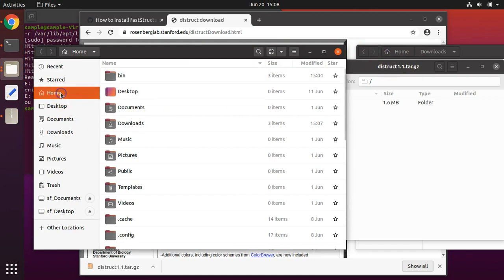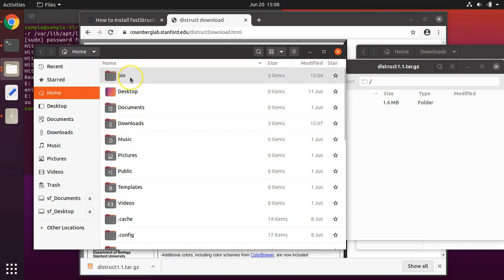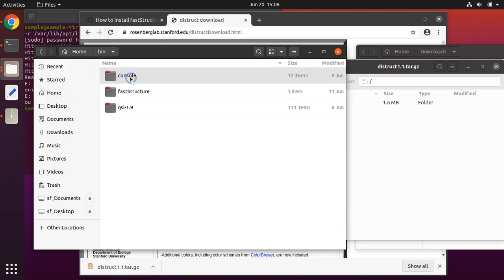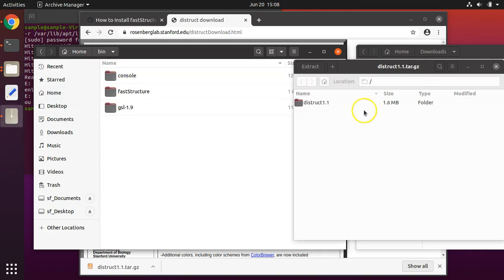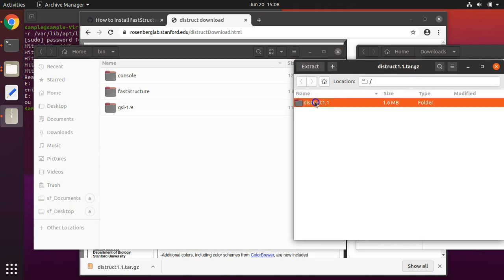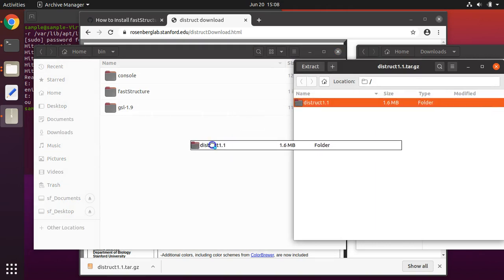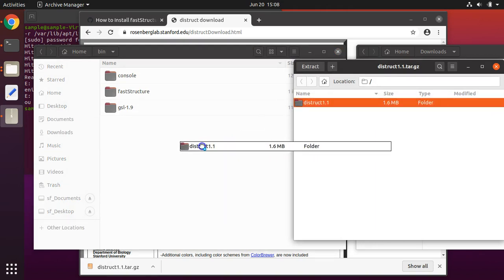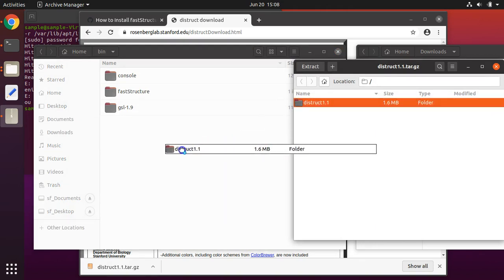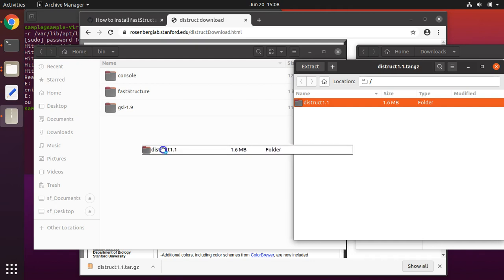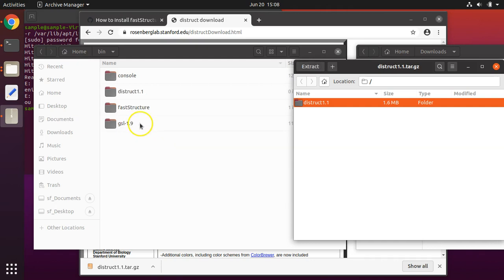Next, go to your home directory. Go to the bin folder within your home directory. If you do not have one, create it. Drag the program DISTRUCT 1.1 from the compressed directory into your bin directory. Then close the compressed directory.